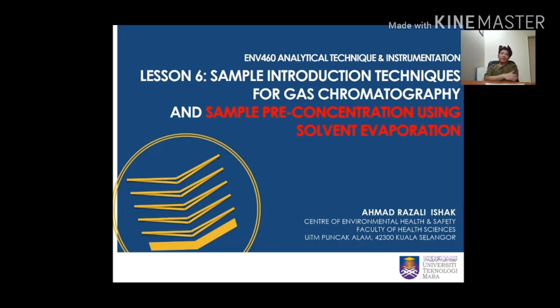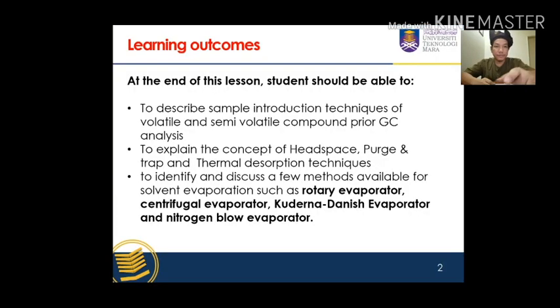Today we are going to discuss the automatic sample preparation techniques, usually equipped with gas chromatography. This is our learning outcome for today's lesson.